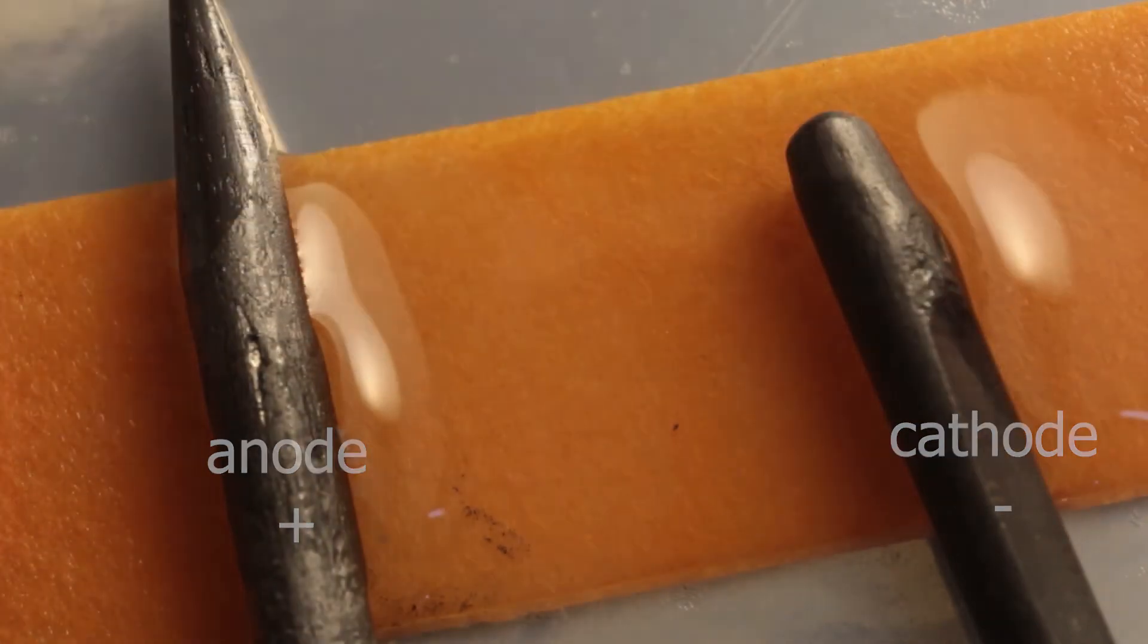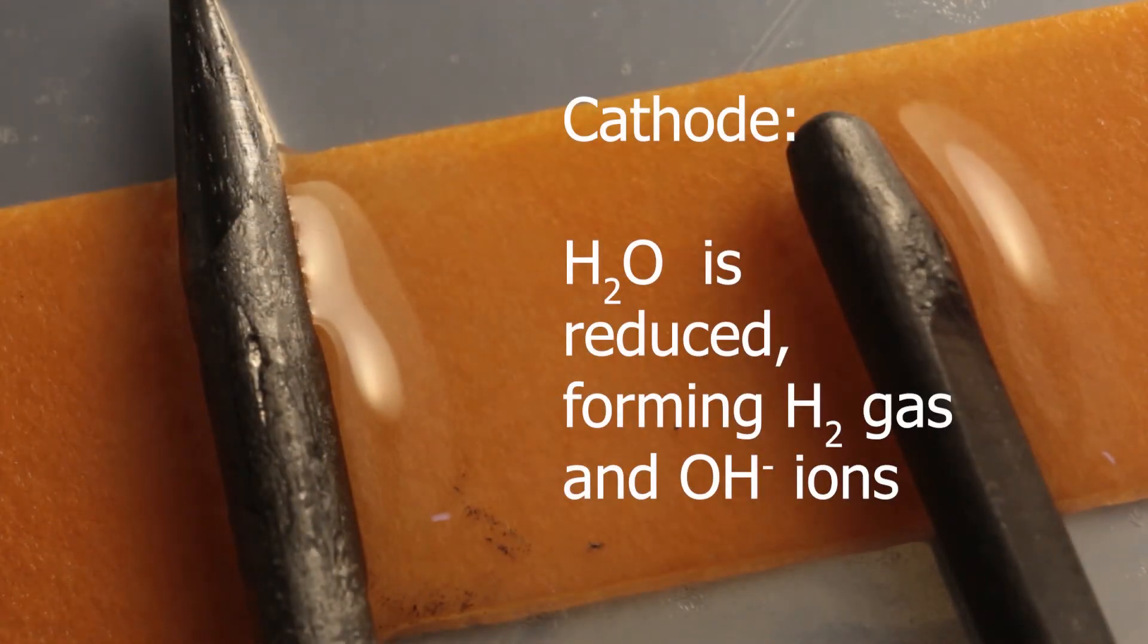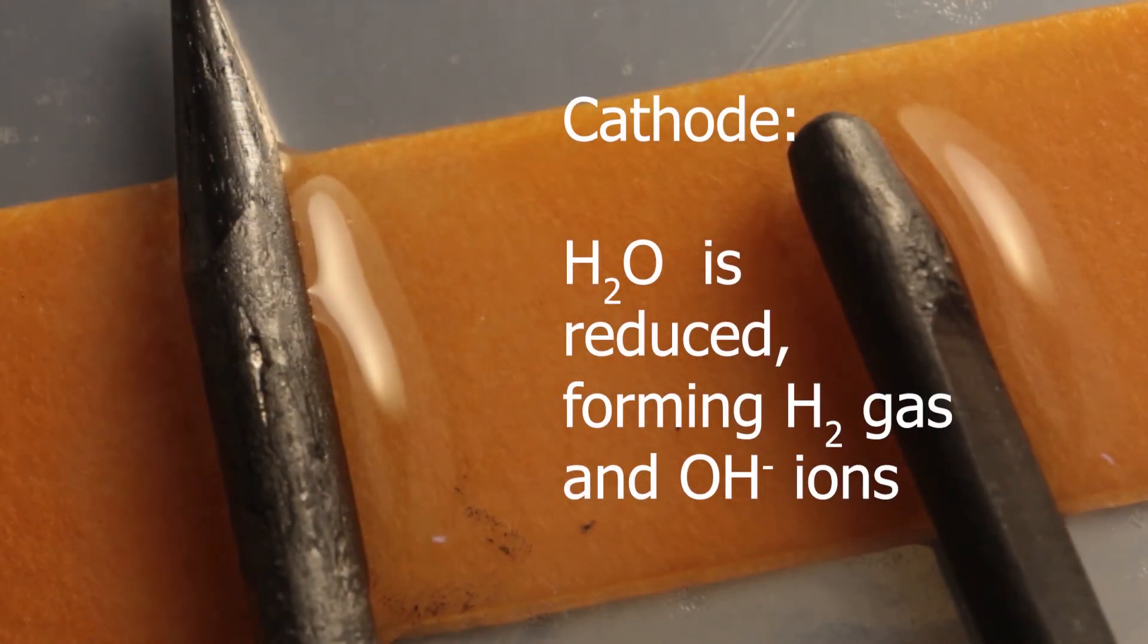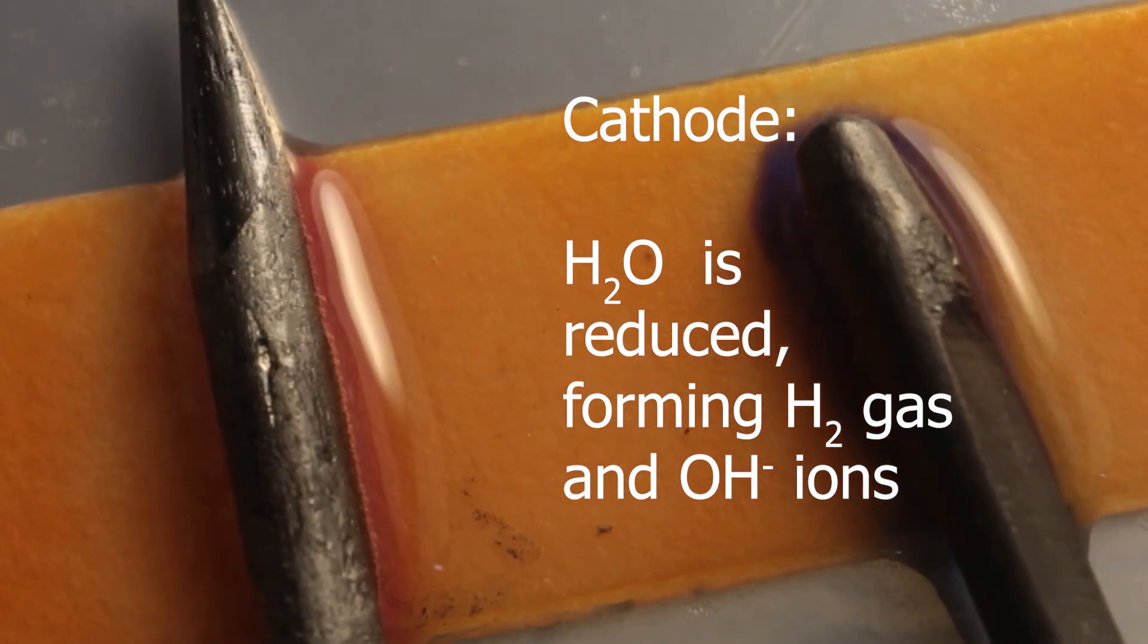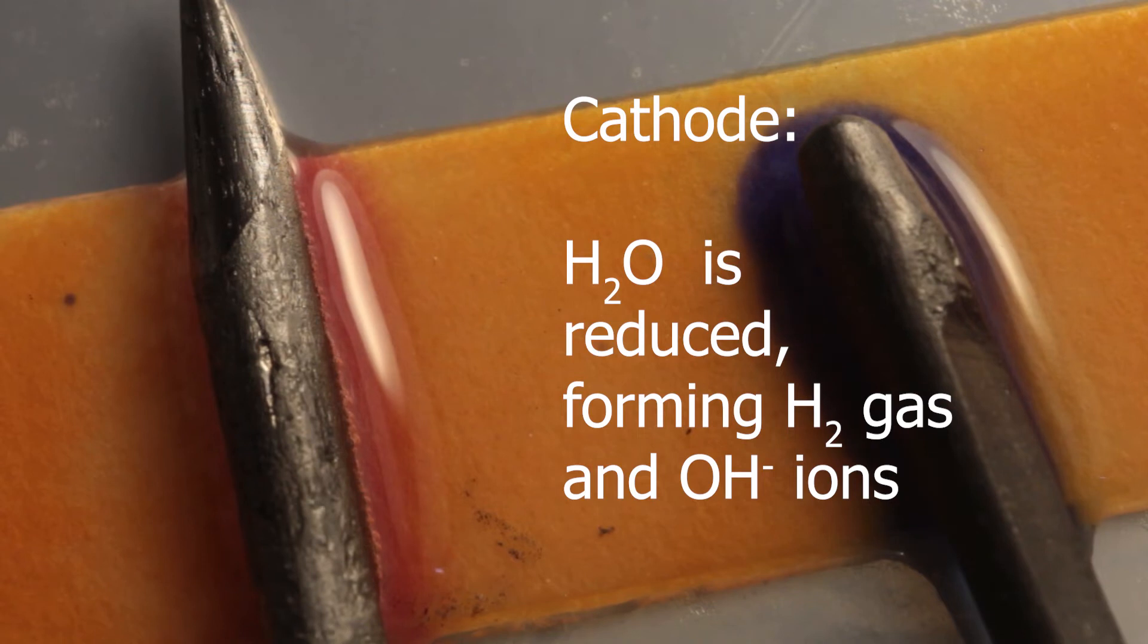So at cathode, water is being reduced, forming hydrogen gas. Because it's hydrogens in water which would receive electrons, hydroxides would be left behind, making medium alkaline.